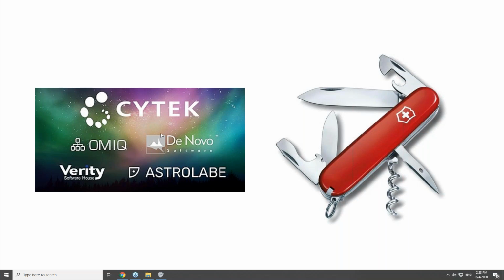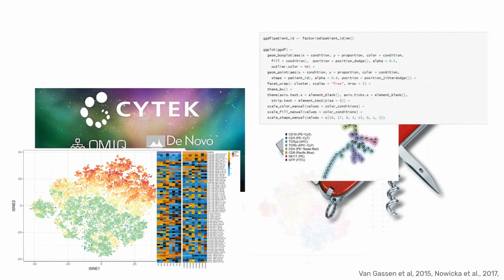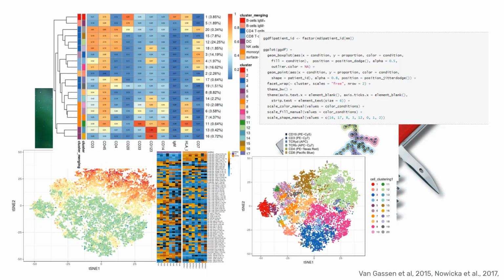However, especially when new people come to the Aurora, especially when people are less experienced with bioinformatics, you start to face challenges. For example, you might not know the different algorithms, or you might not have the time to deal with them, and you're facing this flood of different methods and different tools, which one to choose, how to build the parameters. It can become quite overwhelming. Furthermore, if you've never used high complexity cytometry before, where do you start? What's the first thing that you need to do?